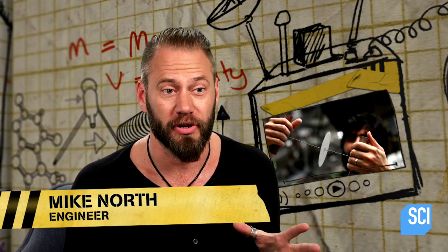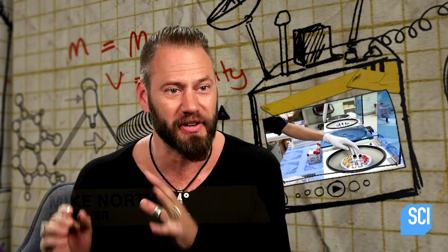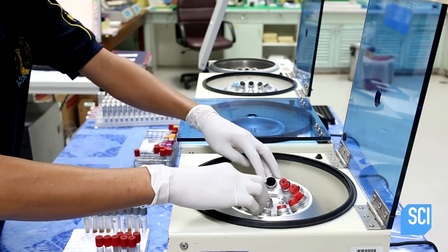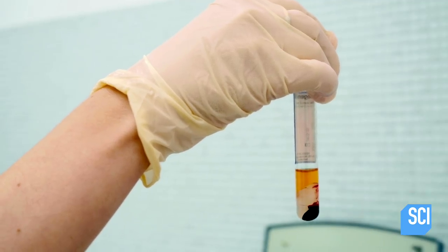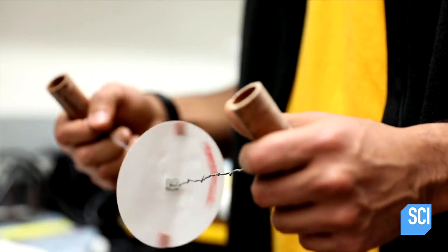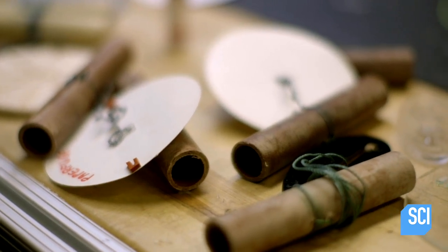This is the paperfuge. It's a paper version of a centrifuge. A centrifuge is a machine that spins samples of blood really, really quickly. Because the stuff inside the samples is of different densities, the spinning means that they separate out. The great thing about the paperfuge is it manages to do exactly the same thing, using not much more than some small tubes, a bit of cardboard and some string.